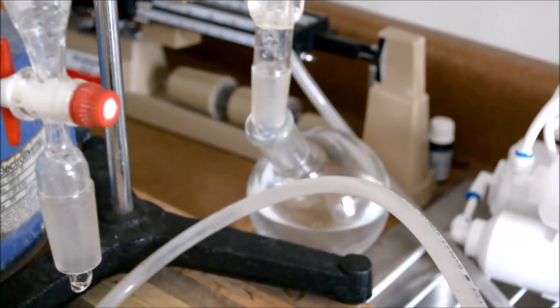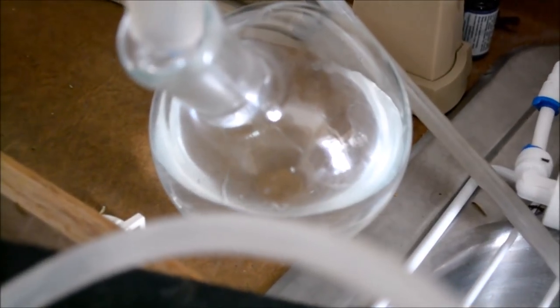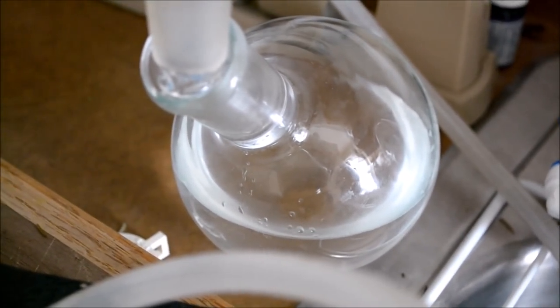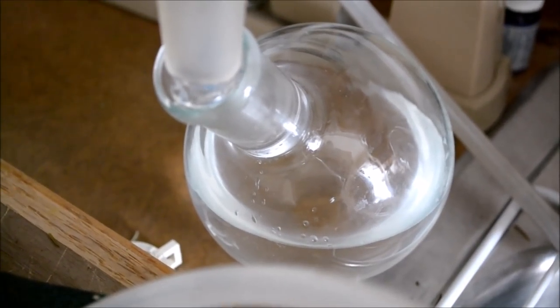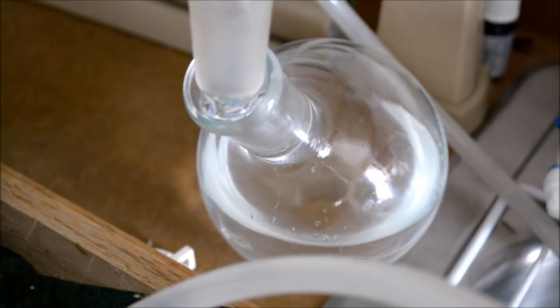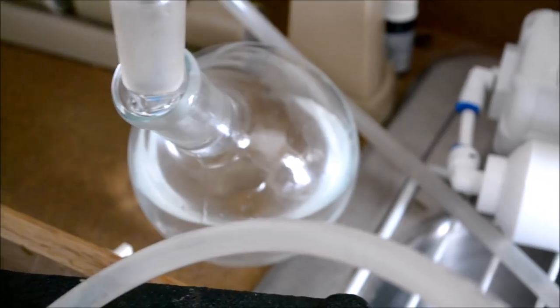Underneath that is the collection flask. That simply collects the essential oil that's dripping in there and the hydrosol as well, which they need to be separated, and hopefully we'll get a chance to show you that.